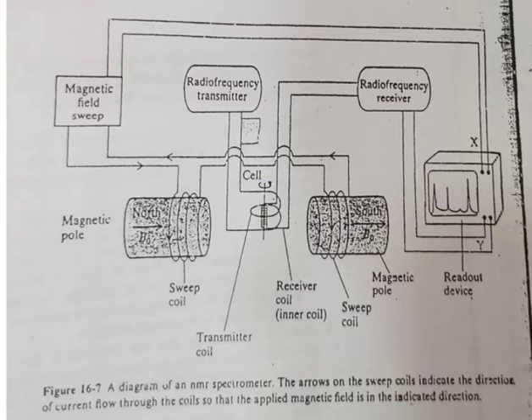So see, initially the diagram starts from here. Magnetic field sweep. The direction of the magnetic field is in this way. The current is passed, then it comes to the north pole, then from the north pole to the cell, from the cell it passes to the magnetic pole which is the south pole, then the signal is again reverted to the magnetic field sweep, then goes to the detector. This is the first way by which the signal is obtained.